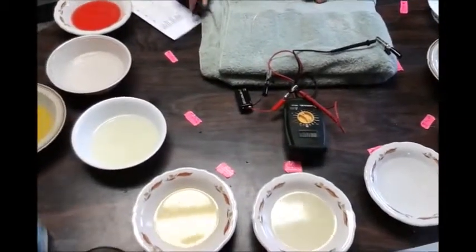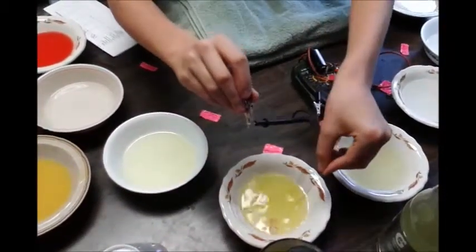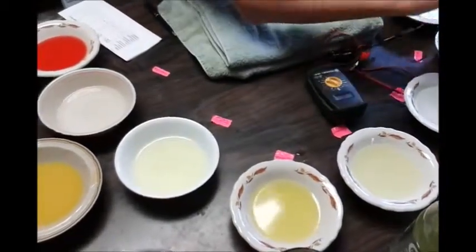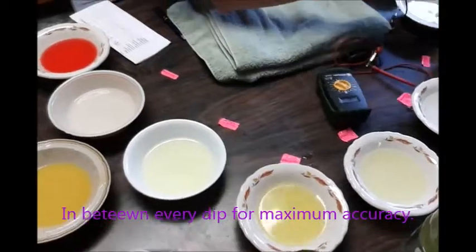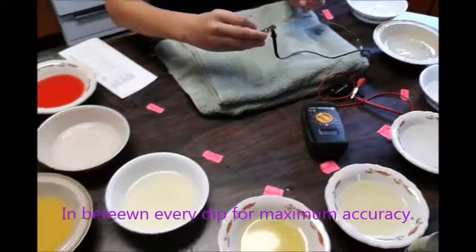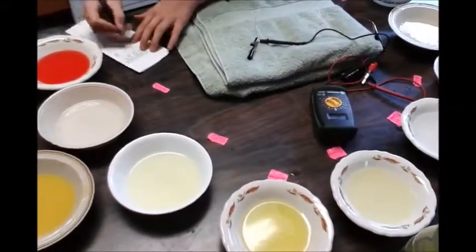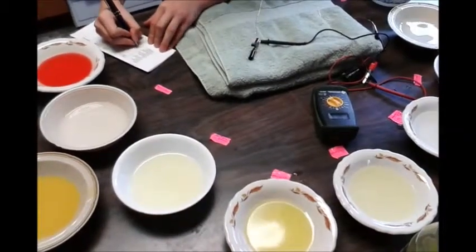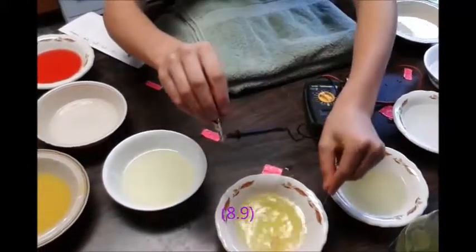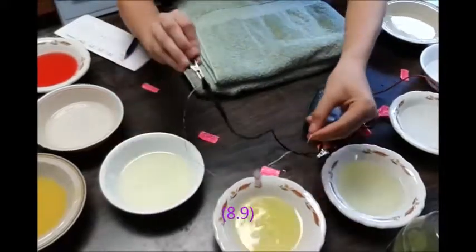Now I'll move on to one of the sports beverages and dip the sensor into the Powerade. It reads 8.9. Then I rinse it in the three distilled water bowls so the readings and electrolytes from the first dip don't interfere with the second or third dip. I write down 8.9 and then put it back in — completely submerged — and get 8.9 again.